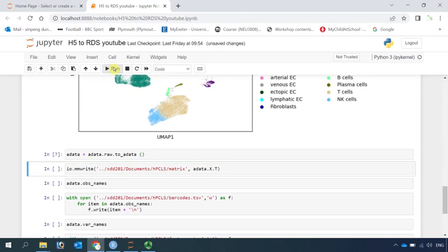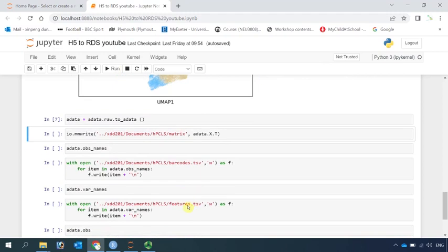In Seurat, when we use the Read10X function, we need the matrix data, barcodes, and gene information. So we can write the matrix data from this H5AD file. Let's run.